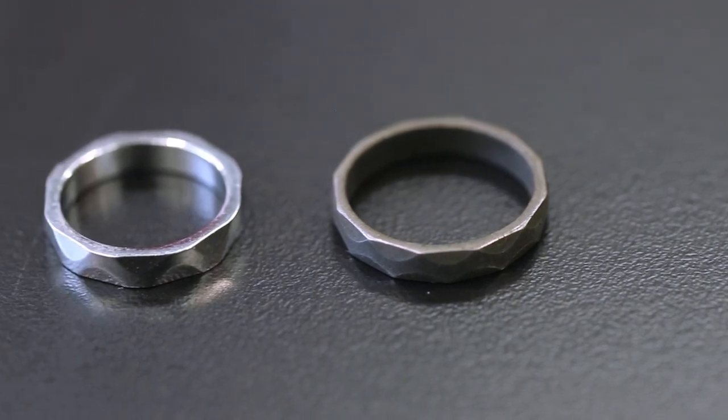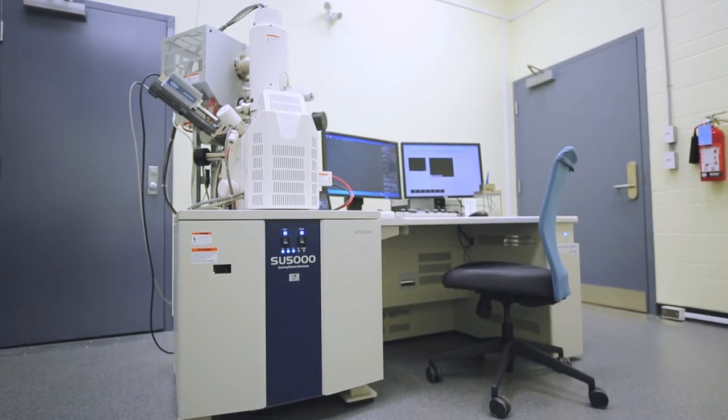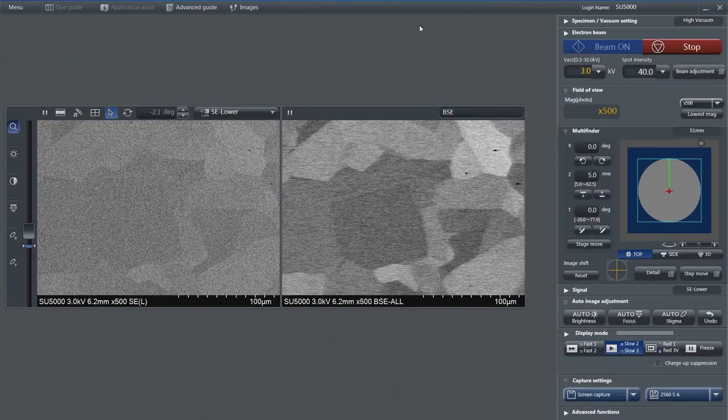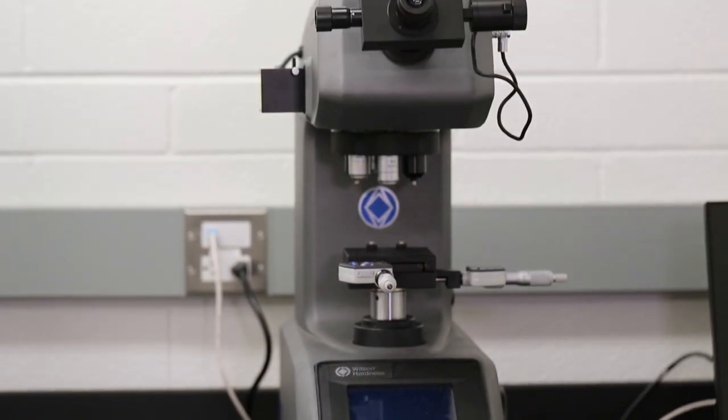There are actually two versions of the iron rings out there. One of them is made of iron, as the name implies, and the other version is made of stainless steel. Using the scanning electron microscope, we could explore the structure and chemistry differences between these two types of iron rings. In addition, I'll perform hardness testing to determine which ring is harder and stronger.